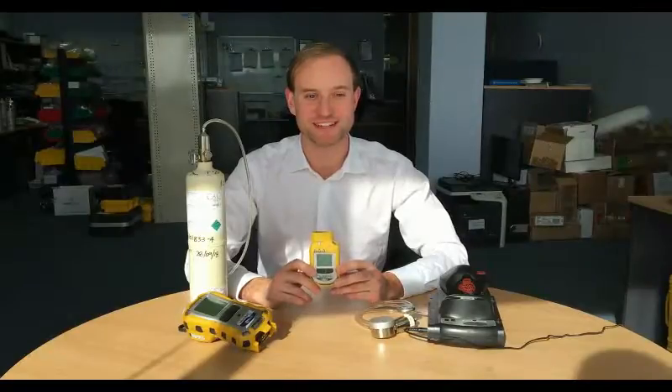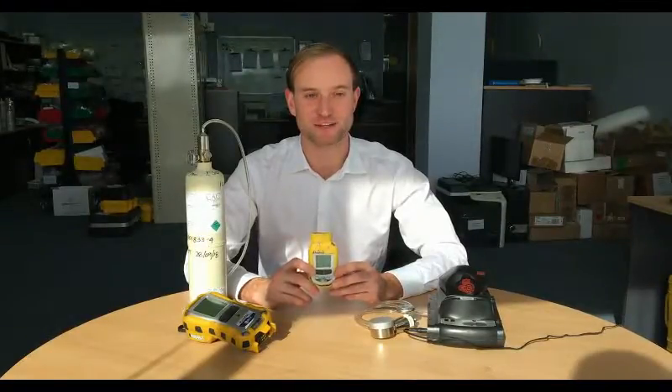I'm Richard from Active Environmental Solutions and today I'll show you how to bump test and calibrate your Toxiray Pro PID.